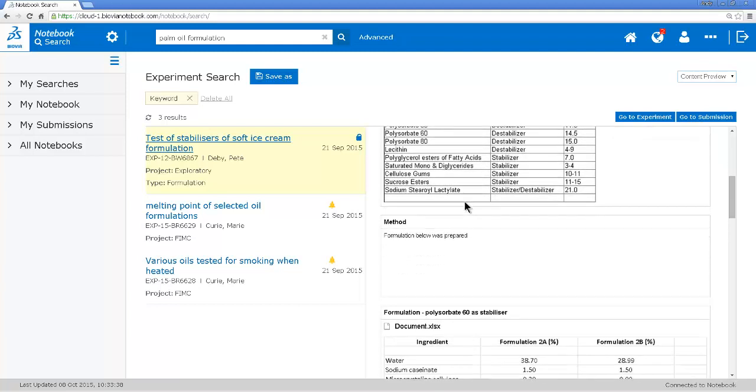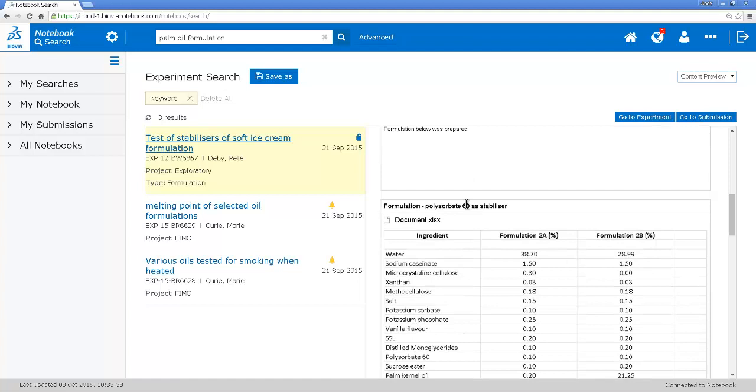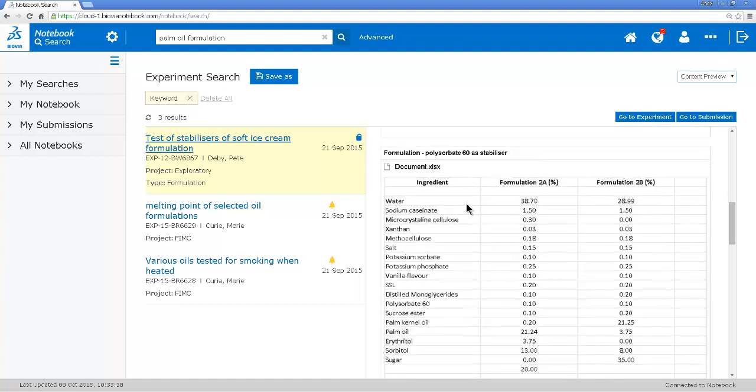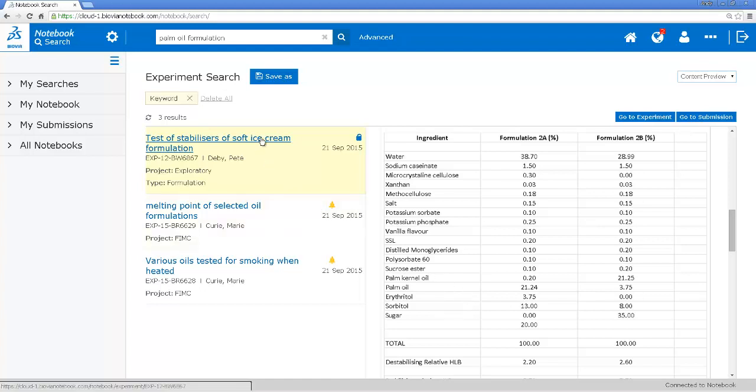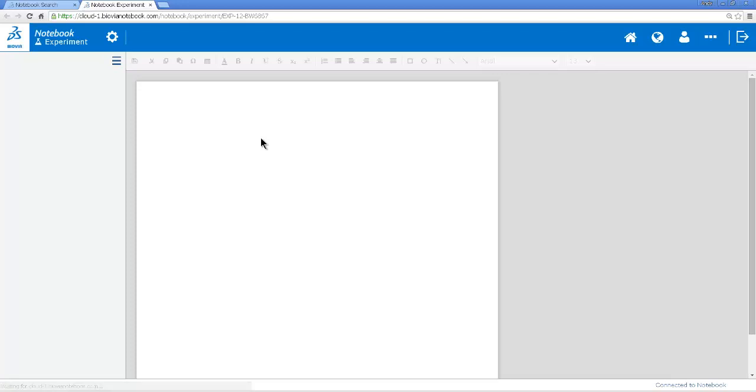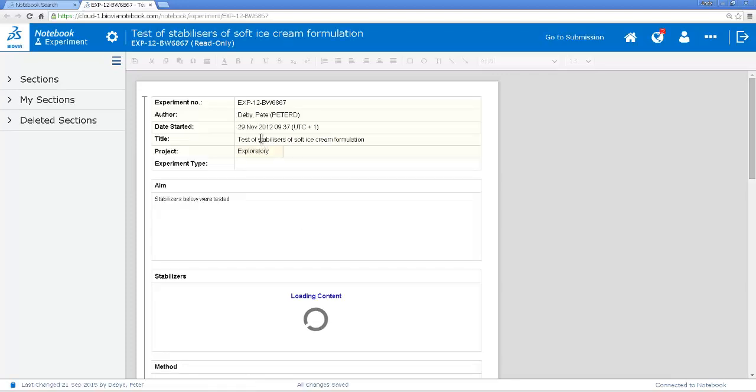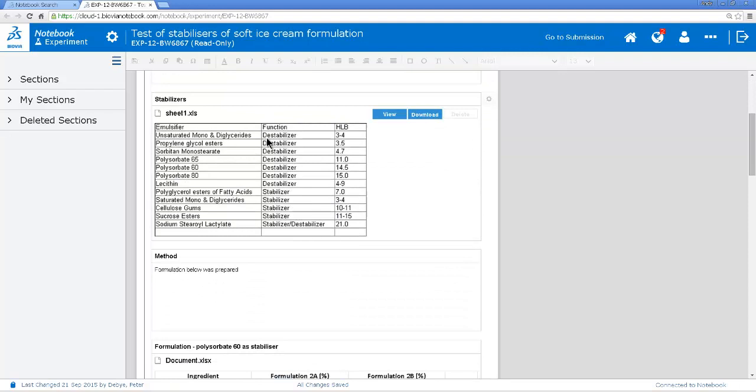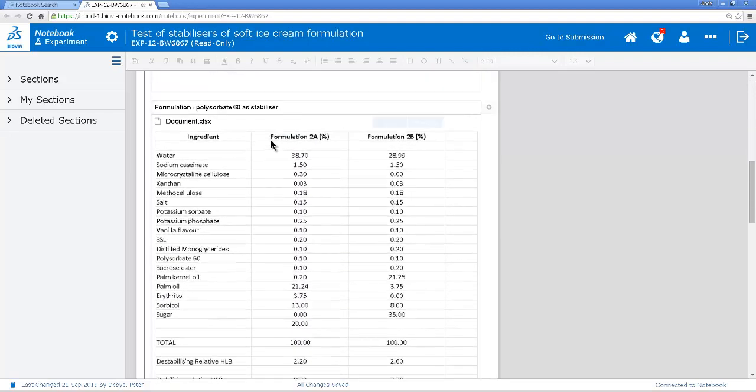So this experiment seems to be testing different stabilizers but here I found a formulation which looks like something I can use. So I'll open up the experiment. It's one of my colleague's experiments. So I look closely at the formulation and it's using palm oil here and I can take this and do my substitution.